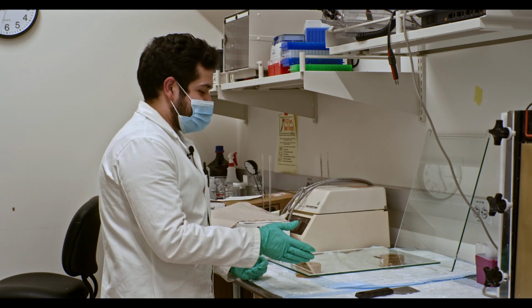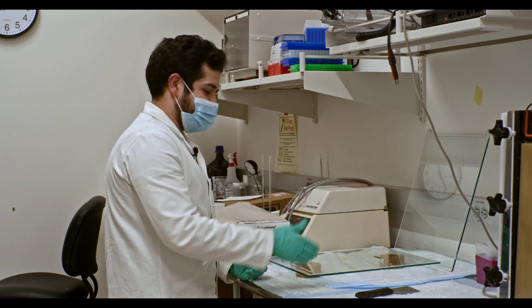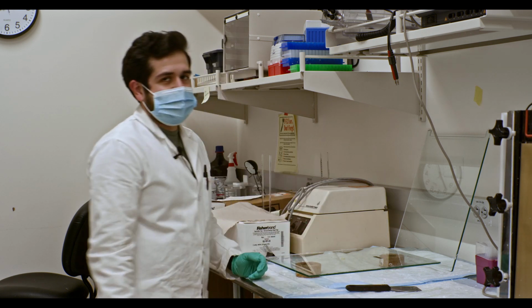I recommend you wash the plates as soon as that gel is off. Whatever little gel is left here on these spacers, it will harden over time. That makes it tricky to get off. So I would recommend that you wash this as soon as the gel is completely off.